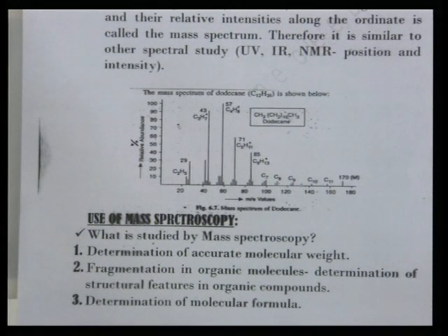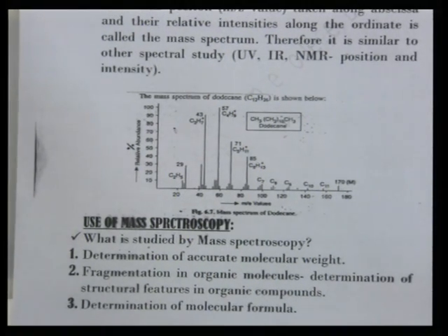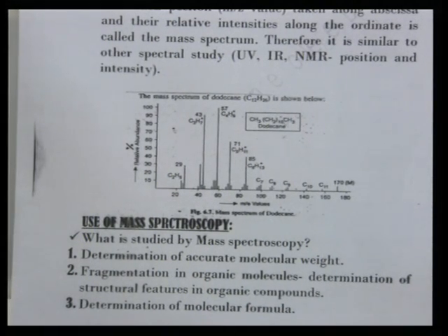For a mixture of 4 or 5 compounds, one is the major and the others are impurities. The impurity peak also gives a mass spectrum, and the molecular structure is determined without using a standard sample of the impurity, and we can also deduce the unknown impurity from the GCMS technique. This is a recent development in the technology. GCMS is a combined technique; GC alone gives purity, but without a standard we cannot give the purity of the compound.